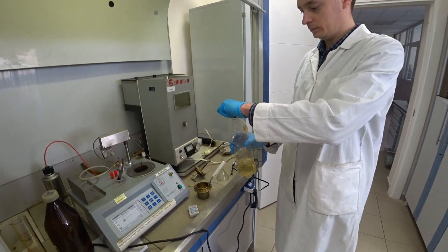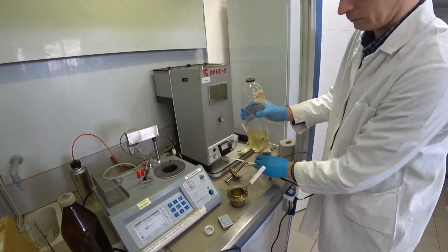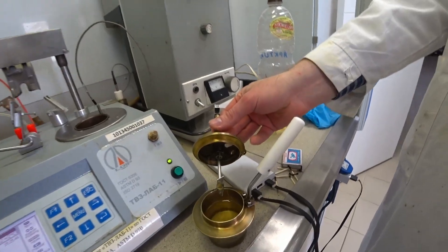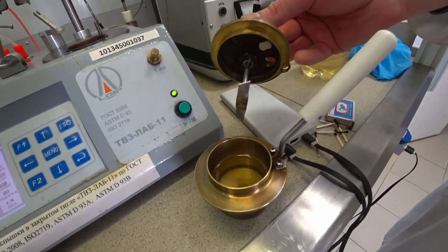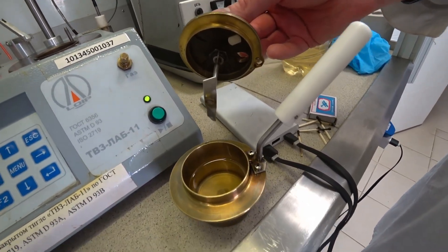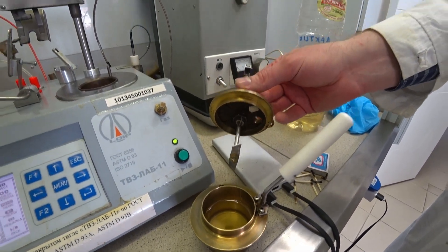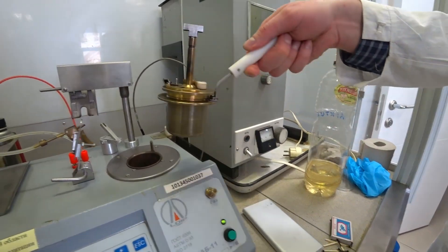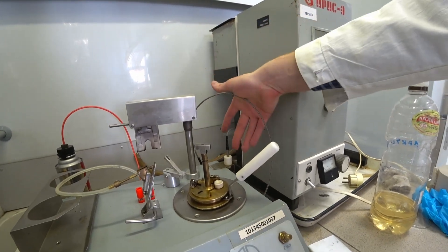Here, this is diesel fuel and this is petrol/benzene fuel. Now we pour the fuel into the cup. Igor has poured the fuel and it must be filled exactly to the line, and then we can close the cup and put it on the apparatus.